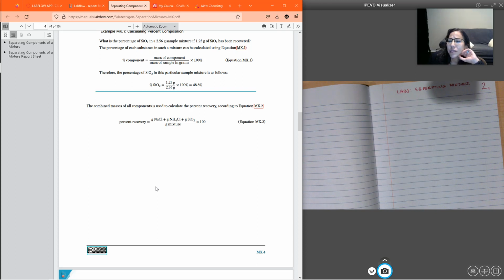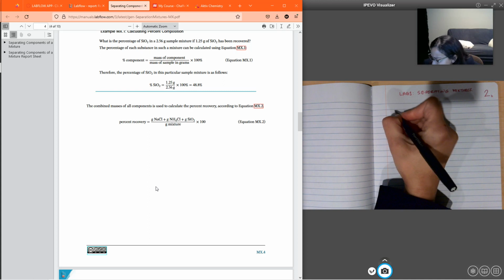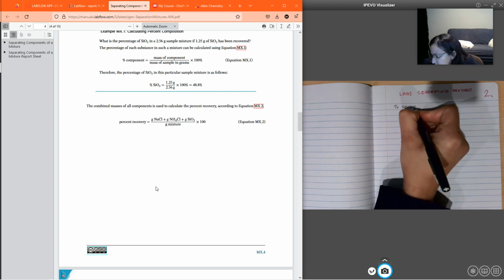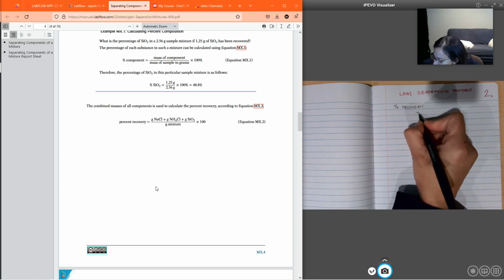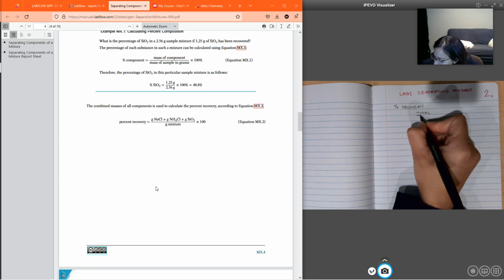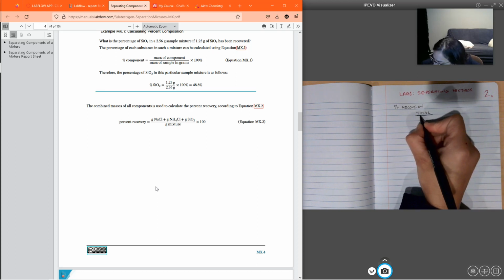Okay. So the next equation is percent recovery. How much did you recover of your substance? So one more time, it's the total of all your stuff that you recovered divided by the amount that you used.